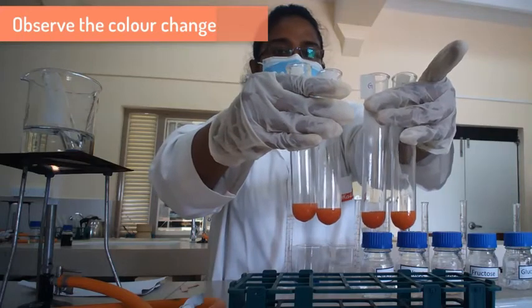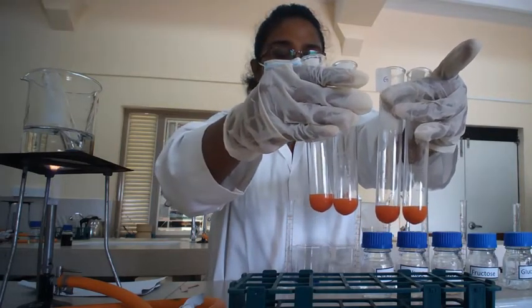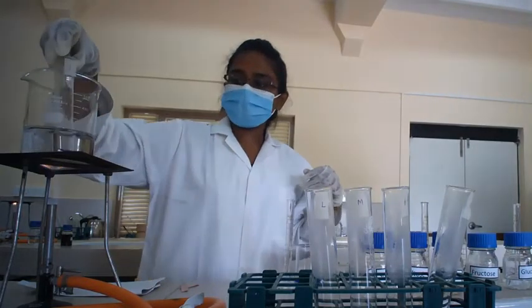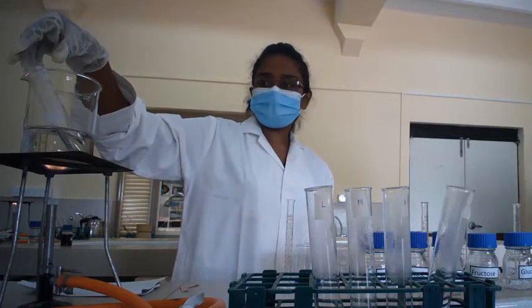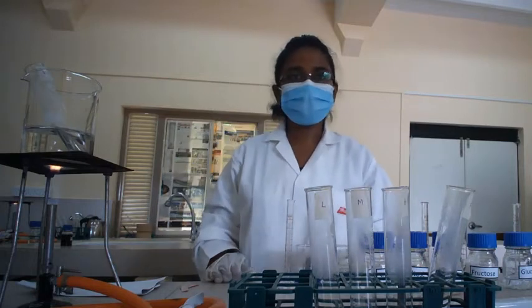Fructose, glucose, maltose, lactose turn into the brick red color. But sucrose didn't change from the blue color. Thereby we can easily say sucrose is a non-reducing sugar.